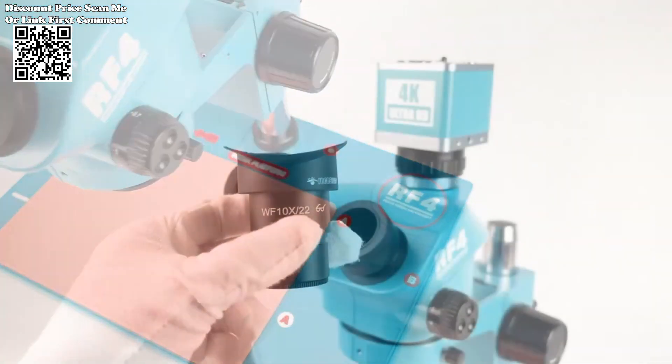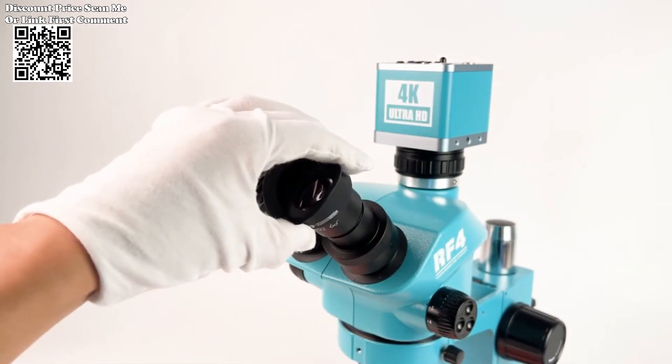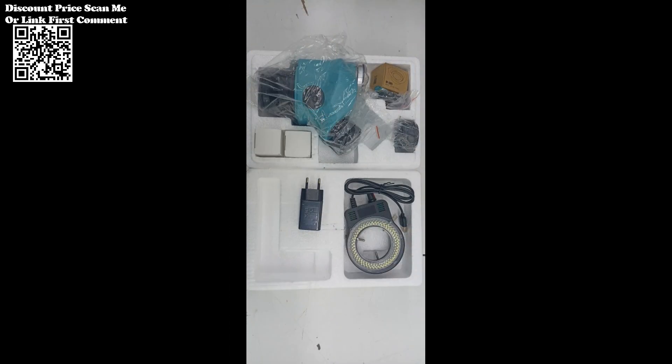CTV Interface: Seamlessly integrate your microscope with other imaging devices using the 0.5x CTV interface. Transfer high-quality images and videos to external monitors or recording devices for enhanced collaboration and documentation.